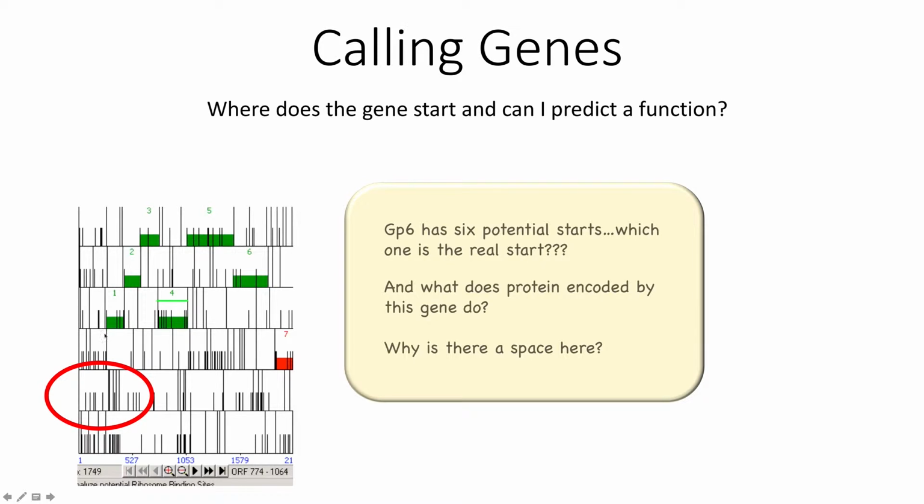You can see that as we go along the genome, there is a gene, maybe in different frames, covering most of this particular section of the genome, with only very small spaces in between, or no space at all. Yet in this first section of the genome, at about 200 or 300 nucleotides, there's no gene called.